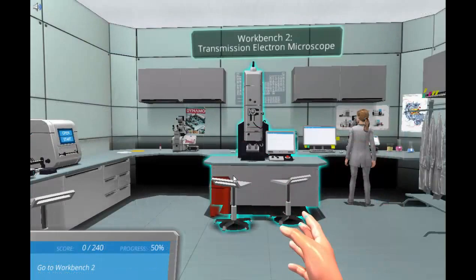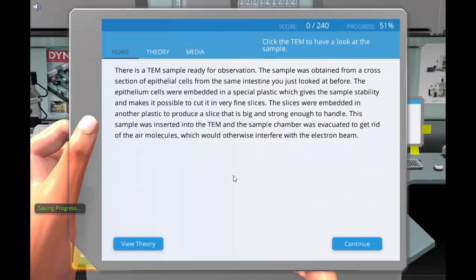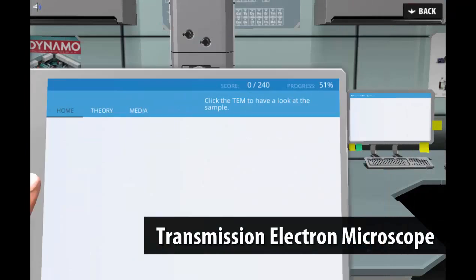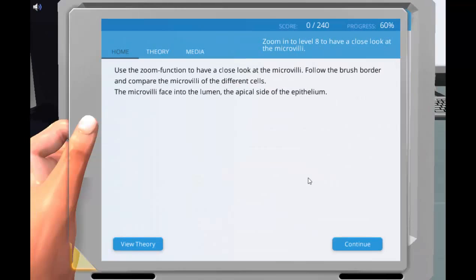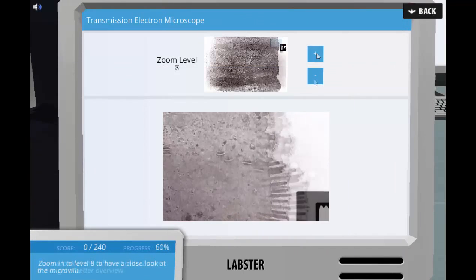In order to visualize objects that are too small to see under the light microscope, students use an electron microscope. In this lab, students examine a chicken intestine slide that is specially prepared for this type of microscopy.